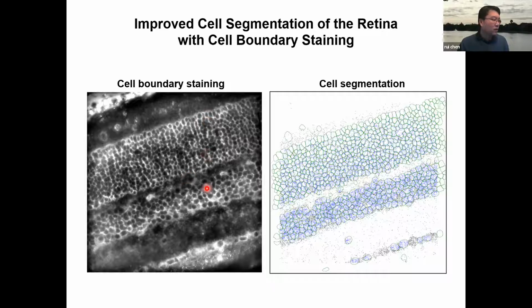You can easily pick out by eye which transcripts belong to which cell. We tried a variety of software out there like Cellpose and Mesmer and other things, and we were able to reach a reasonable segmentation. I still think there's room to improve, but if you just eyeball it, it seems quite consistent with what you would highlight yourself.